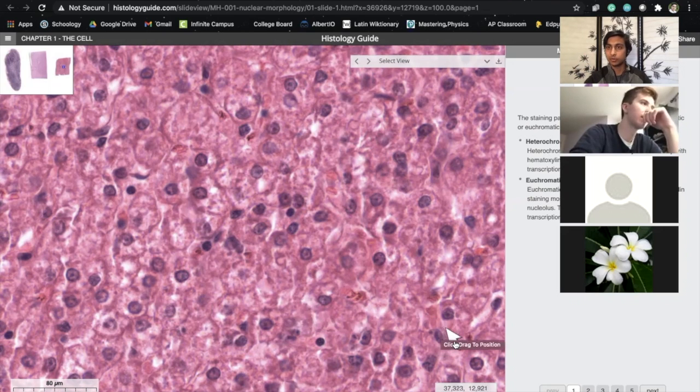And then just so you know, when you take a biopsy, and when you're looking at something on a slide, and you've done this in your biology classes, right? You need a very flat level sample, right? What you're looking at has to be flat and cut. And so when they do this, they have to have a very thin slice of tissue.